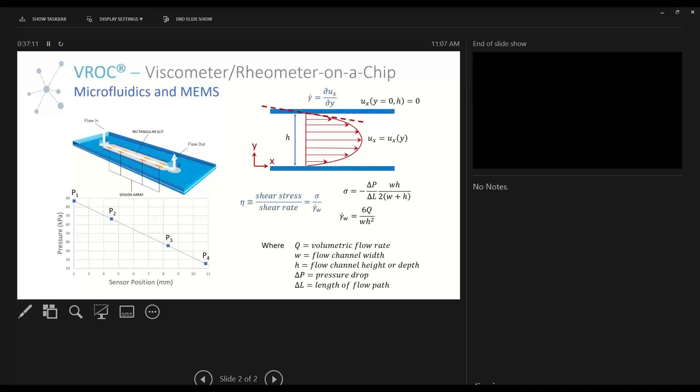One of the participants is asking: how easy is it to change the chip? So the chip is actually only held on by three points of contact.